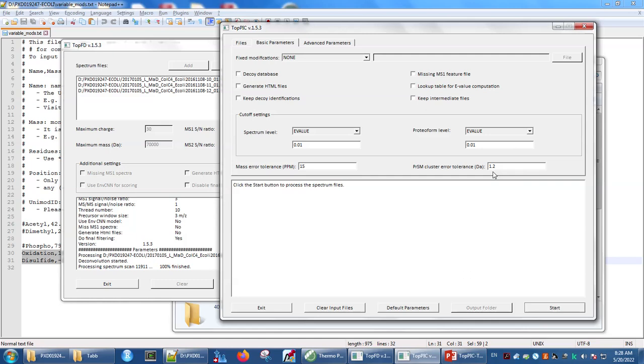The reason we do this is that it's quite easy, in the case of looking at these precursors, to make a plus or minus 1 Dalton error on the mass scale, because we have the possibility of picking the wrong monoisotope for each peak, for each precursor. So we're going to keep that fairly wide, and it allows the software to find more copies of each proteoform that have been identified independently.